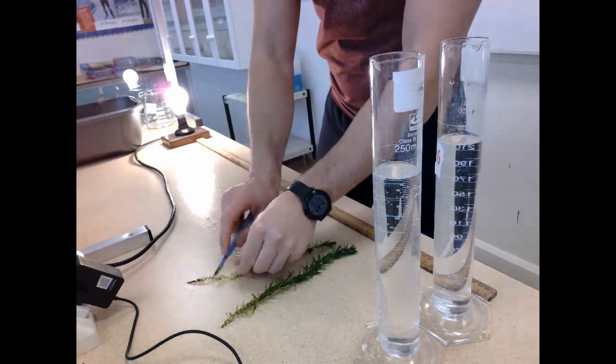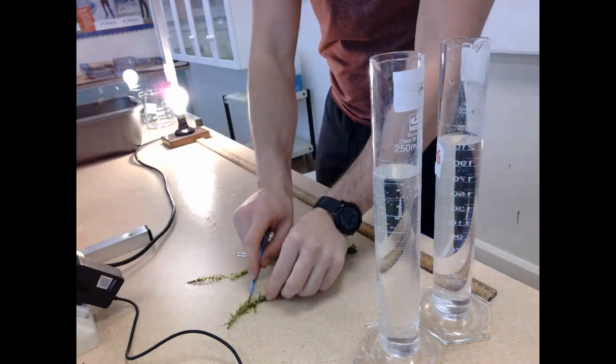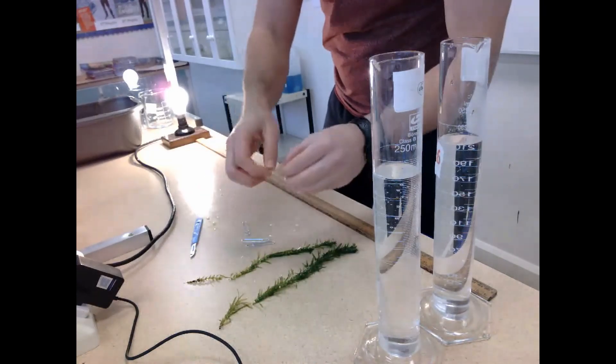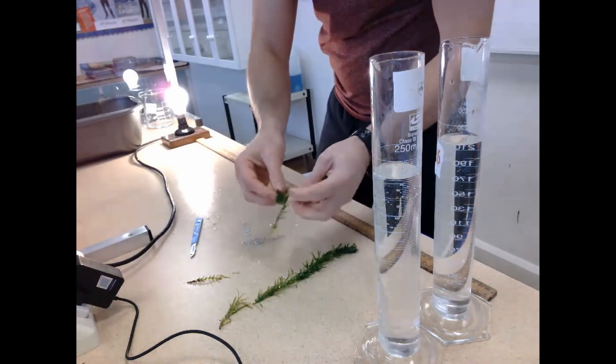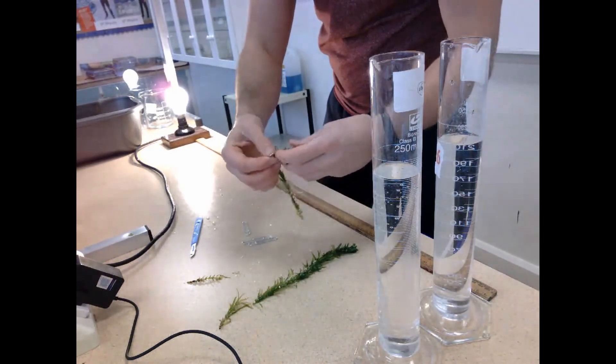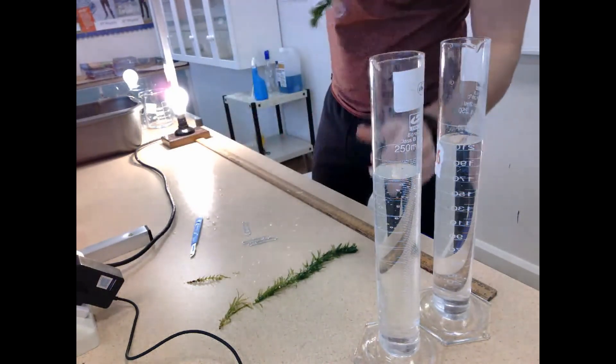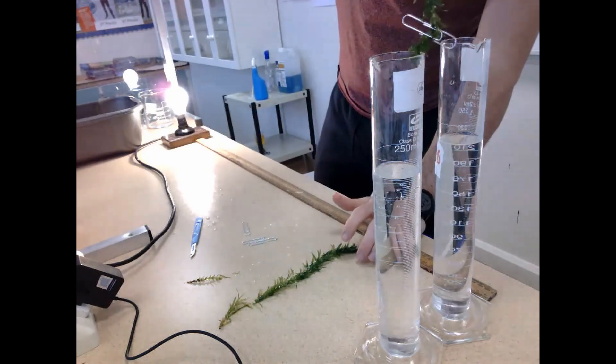I also take a paper clip and add it to the bottom of the elodea because this is going to weigh it down and keep it below the level of the water throughout the experiment. And this is really important again because the whole point here is we need to be able to see the bubbles being produced to track the rate of photosynthesis itself.